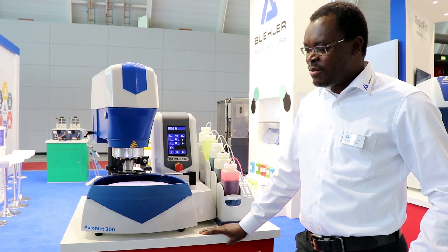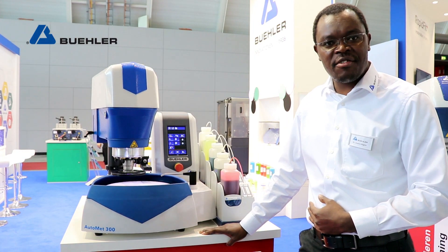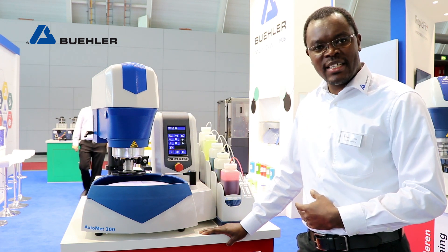Welcome to Control 2019. This morning I'll talk to you about the AutoMet 300, one of our new semi-automatic grinder polishers.